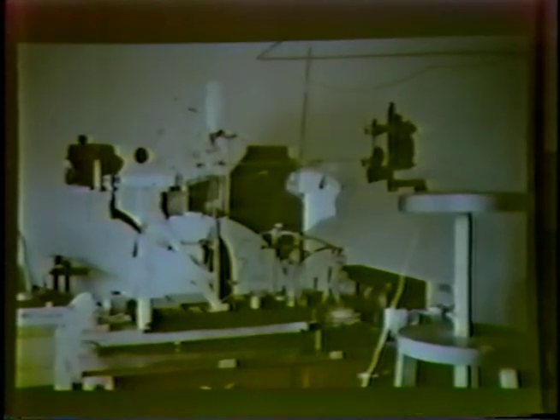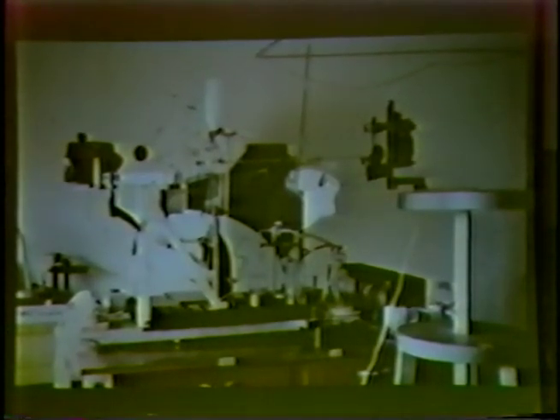Now, the very highest frame speeds that have been obtained in confocal microscopy are those obtained with the tandem scanning reflected light microscope of Petran and Hadravsky of Pilsen in Czechoslovakia. And in case you don't know it, Pilsen is as famous as a brewery town as Milwaukee, Wisconsin is on this side of the pond.